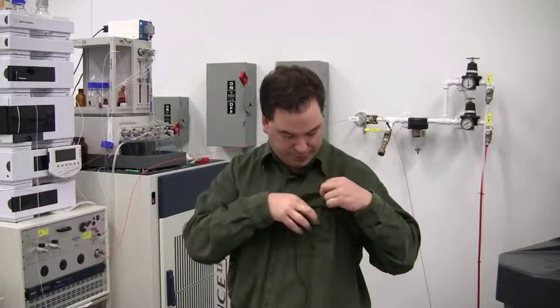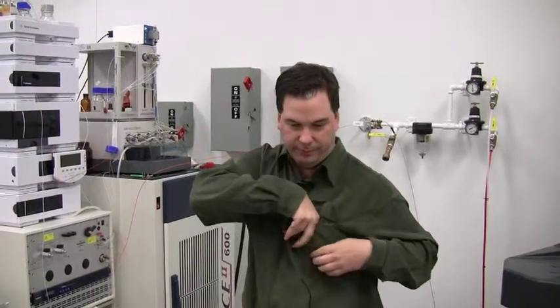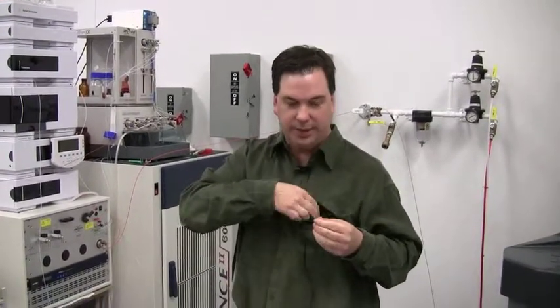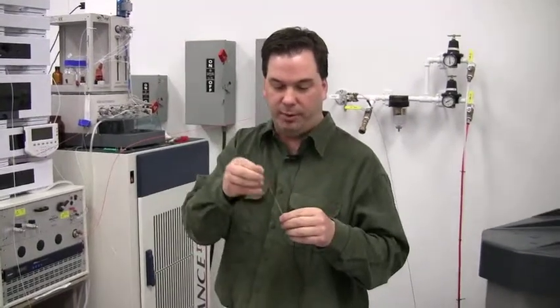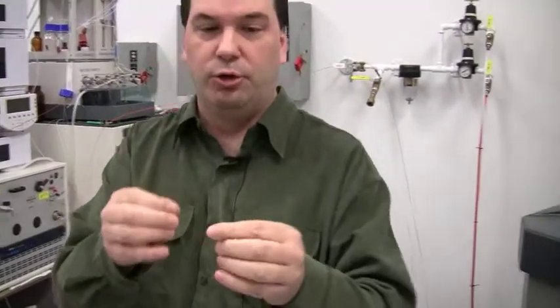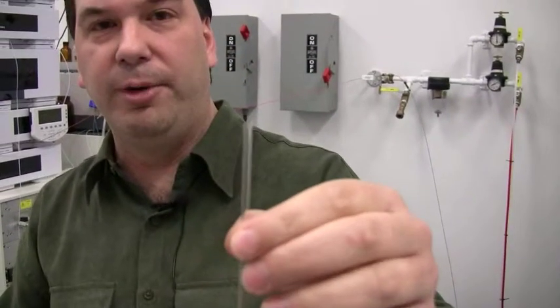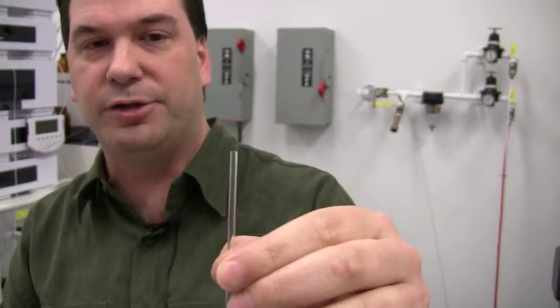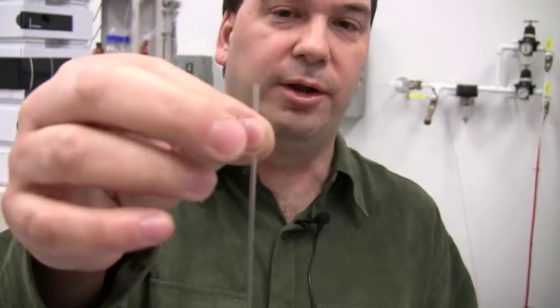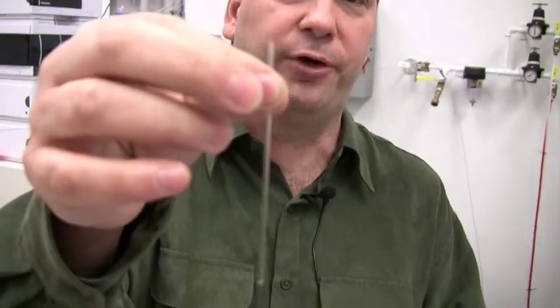The other advantage we have is that we could take the NMR spectra in small diameter NMR tubes. We could use a 3 millimeter NMR tube, which holds about 125 microliters of material, or we could use a 1.7 millimeter NMR tube, which holds about 45 microliters.